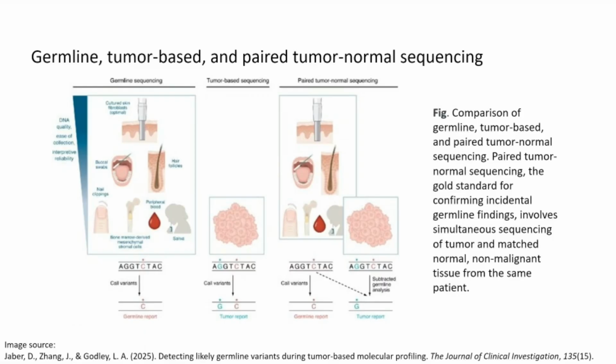So let's say we have the liver organ, and we have a tumor inside in one location. For the tumor sample, we get biopsies of the tumor from the liver, and the normal sample could be other non-mutated tissue inside the same liver organ. This is called the paired tumor-normal samples. This can help us identify what variants are carried in the liver tissues, and what mutations are carried by the tumor tissues.